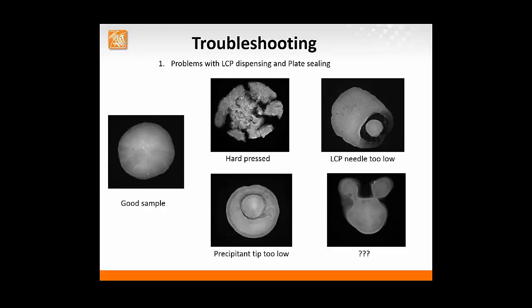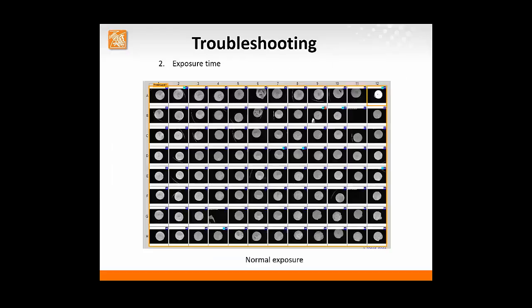If you compare conditions that have different shapes, they could not be directly comparable. Also, if you have these irregularities in the dispensed drop, a bleaching spot can come into the place where the sample is disturbed or there is no sample at all, and again the results will not be reliable in that case.